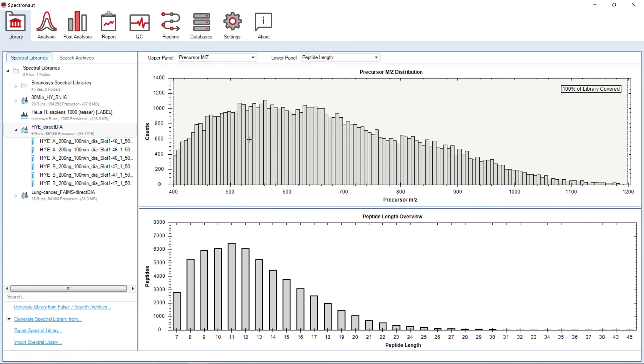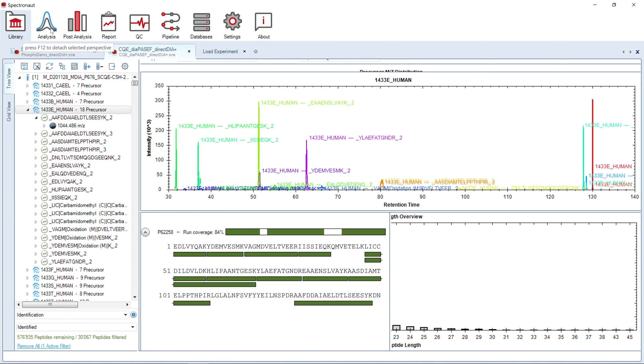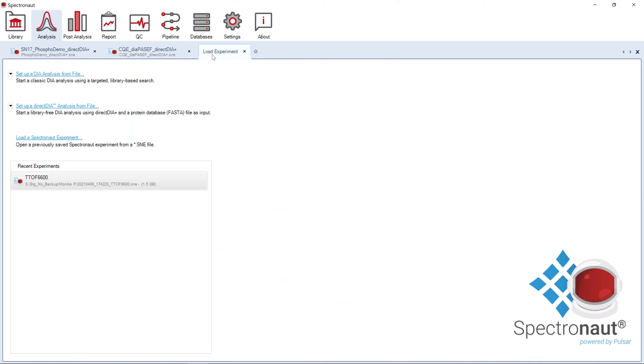Moving to the analysis perspective, you can set up DIA analysis either using a previously generated Spectral Library or by utilizing DirectDIA, a proprietary diagnosis workflow for analyzing DIA data without the prior step of library generation.